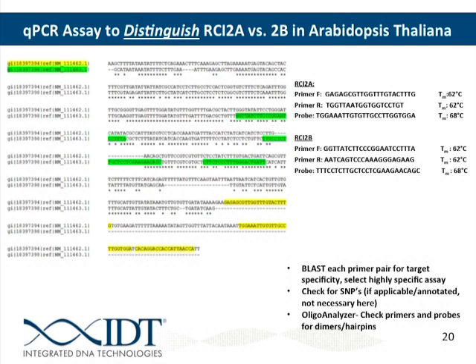So we can tell PrimeRequest not to put the probe from 1 through 105, for example. Oh, it's got to start with 1. That's right. And then also 140 through the end.